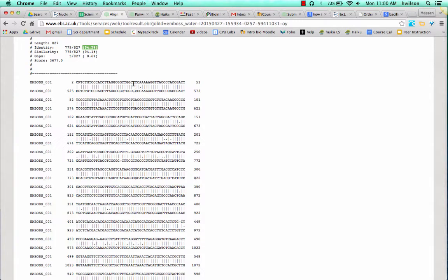Where you don't see a dot or a line, those are basically gaps. It didn't align here.